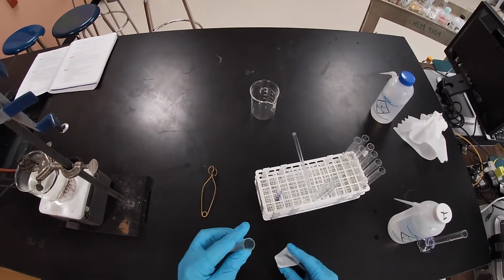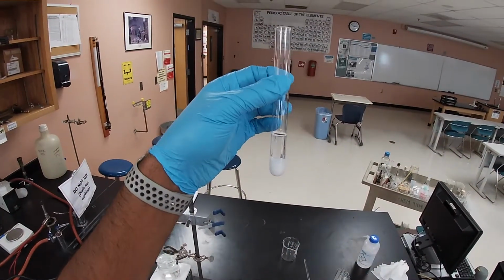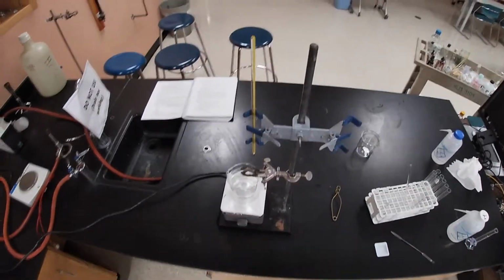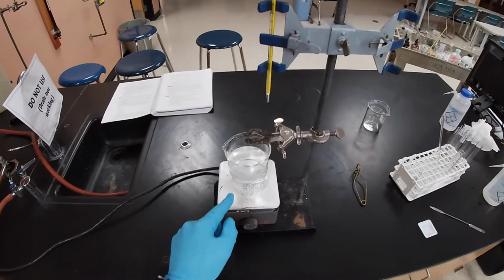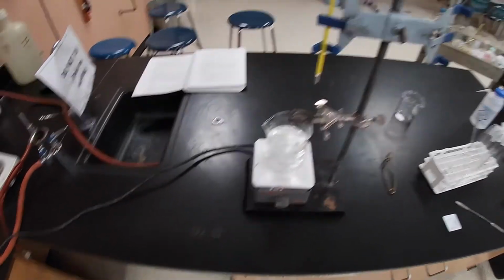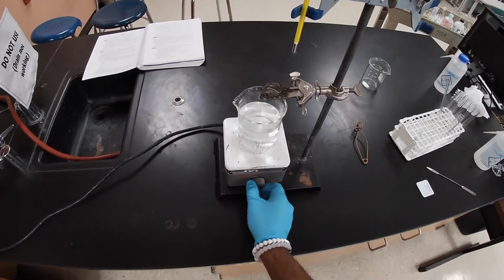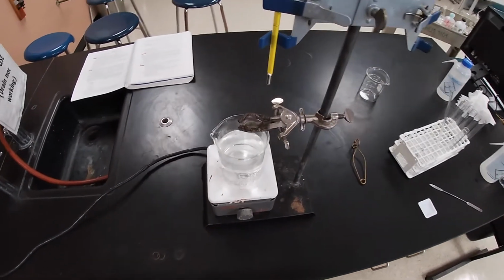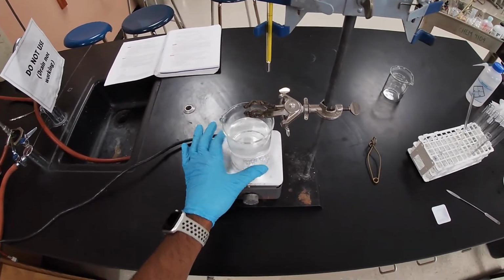And we got all of it. And so now, as you can see, here we have our test tube with 5 milliliters of water. What I'm gonna do now is, I already have my setup going. So I got my thermometer, we got my test tube clamp, and here we have a water bath that we have been heating up for a bit. And so I'm just gonna heat it up slightly more, right? I'm gonna increase the heat. And so I just wanted to make sure that my beaker was already warm, and it is.